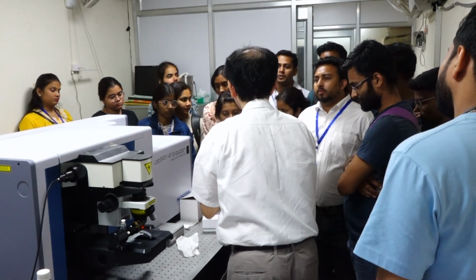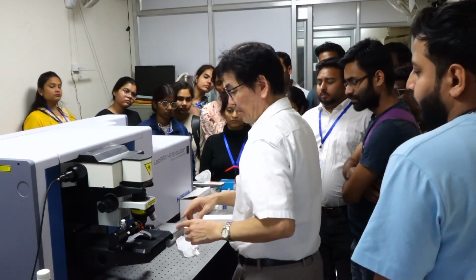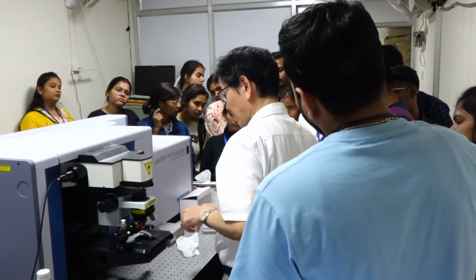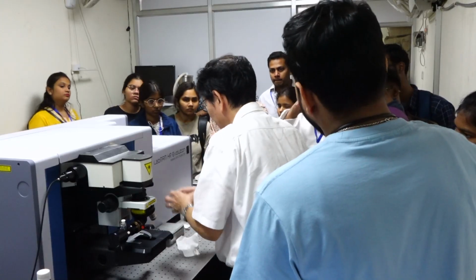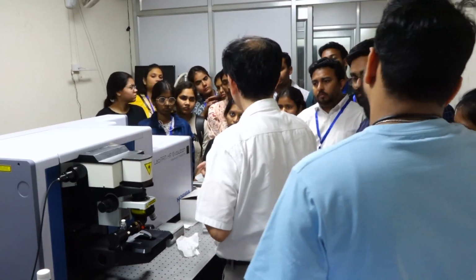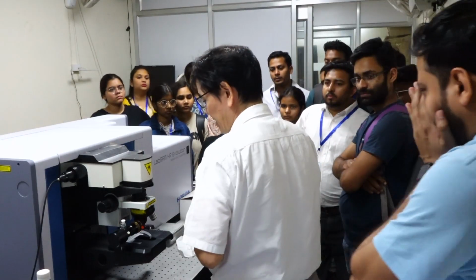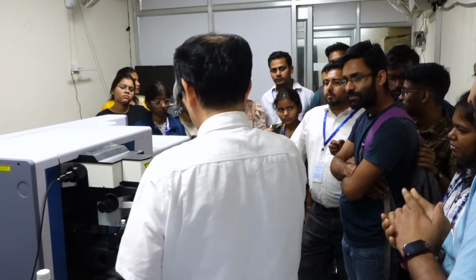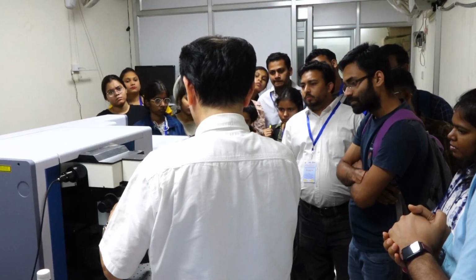Where is the sample loaded from? The sample is typically placed here on the microscope stage, and the XYZ position of the sample is tuned finely. Then we find the good position. And one more thing I explain this time is that in today's experiment, we use some attachment.